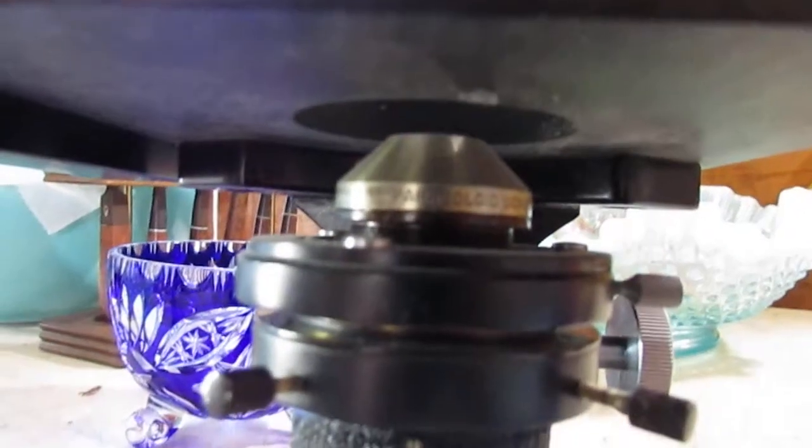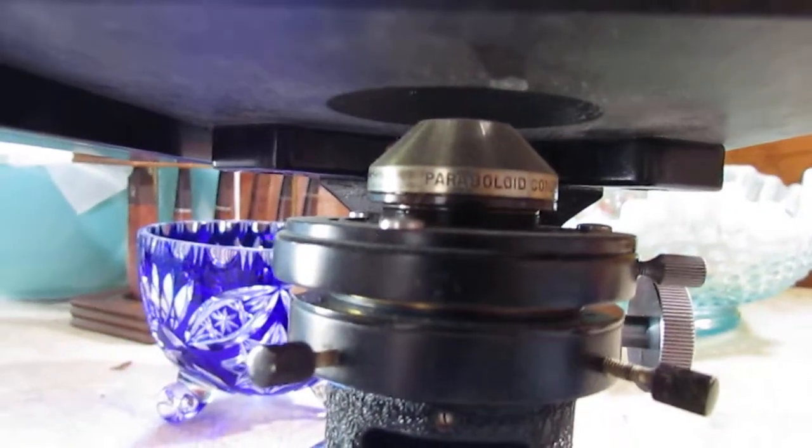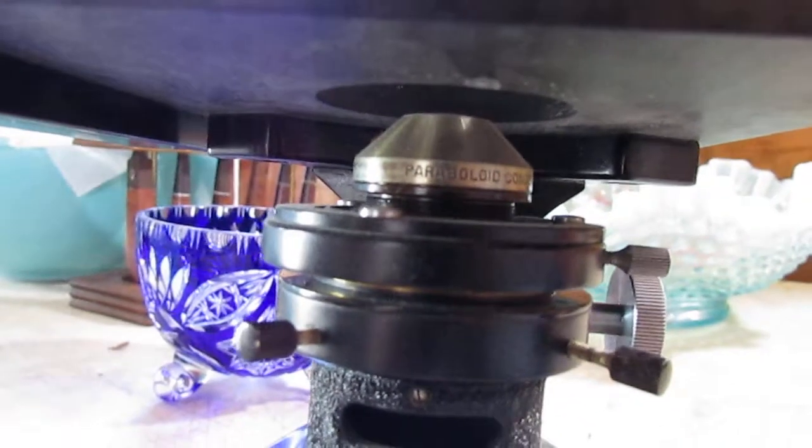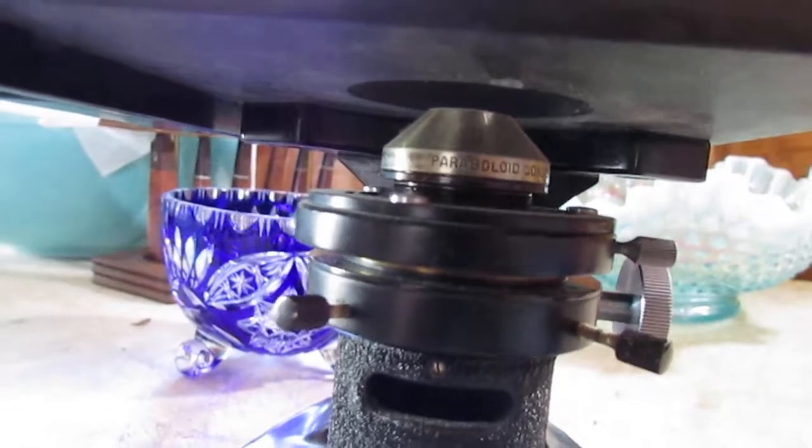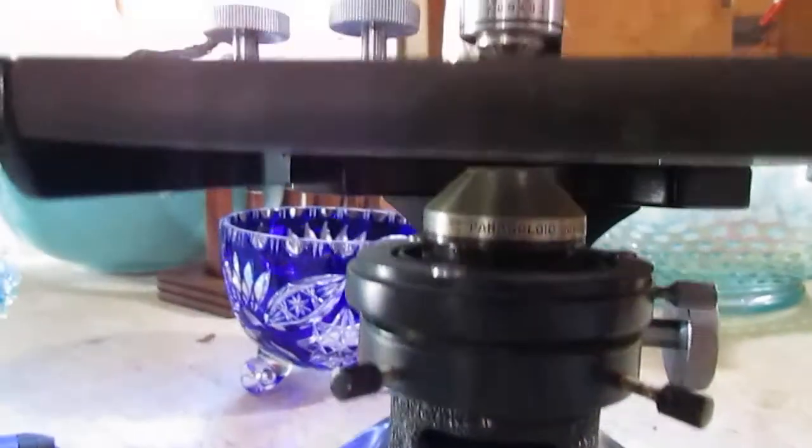So, you know, we want you guys to see what this thing looks like and what it does or does not do in this video. And place your bids based on that.